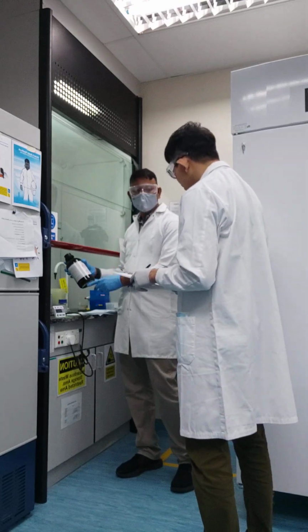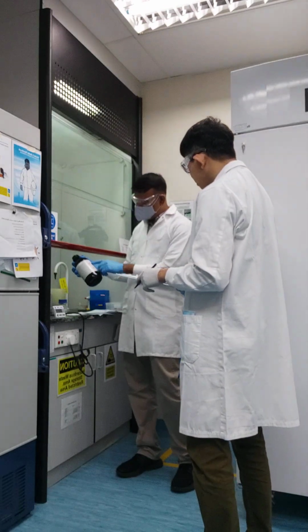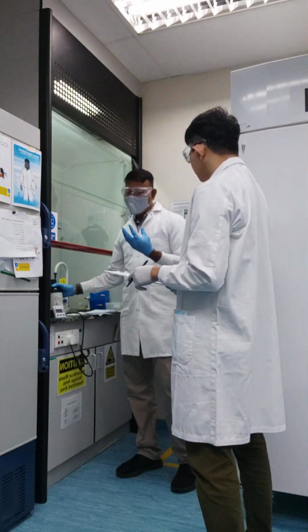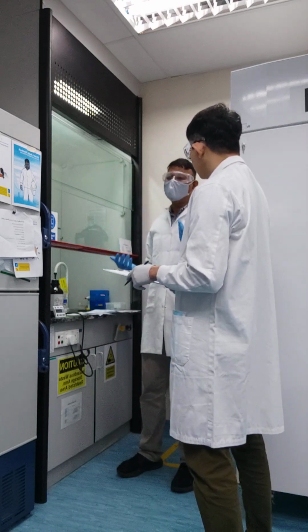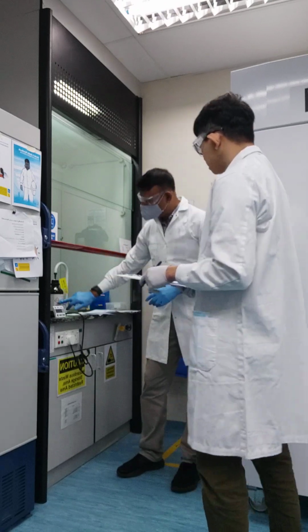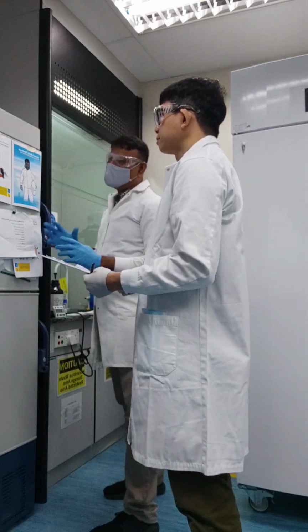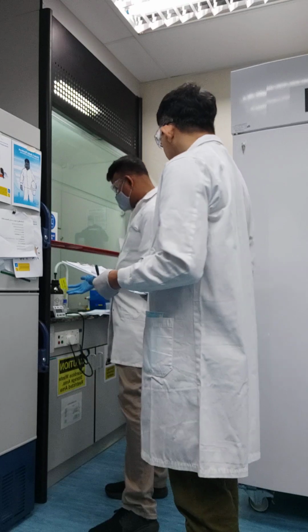recognize the symbols. Okay. So basically the symbols that are here are for you to identify the physical and chemical properties, and it gives quick information about the hazards. So in order to recognize the symbol, I have provided a GHS chart, Globally Harmonized System GHS symbols, from the chemical information.